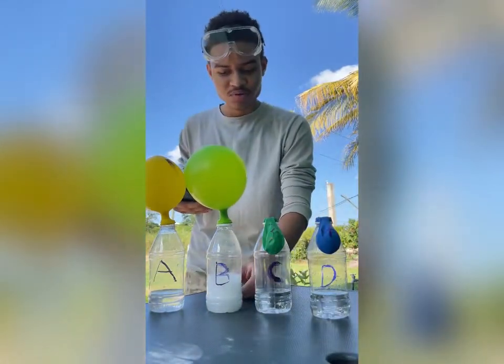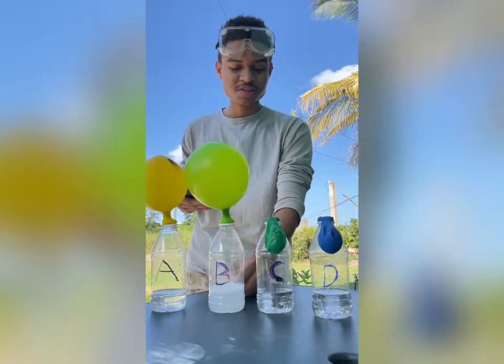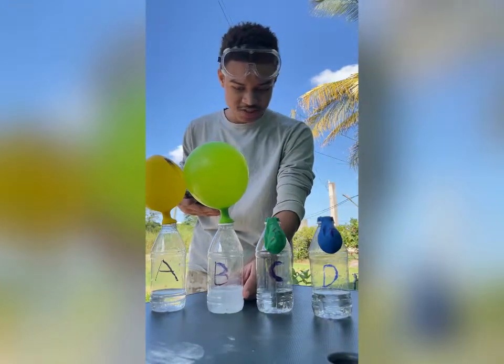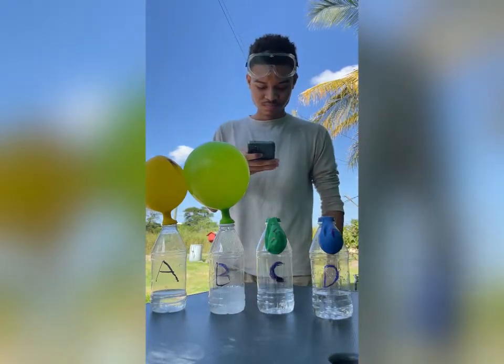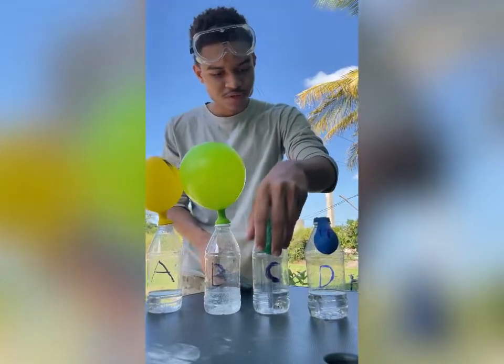As you can see, the same process that occurred in bottle A is occurring in bottle B, but a more rigorous reaction occurs. Now we're going to bottle C.